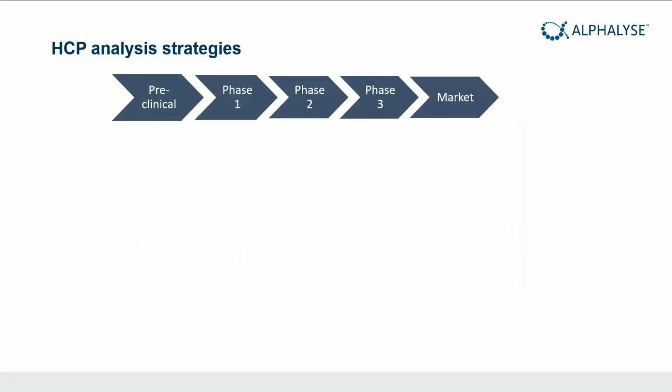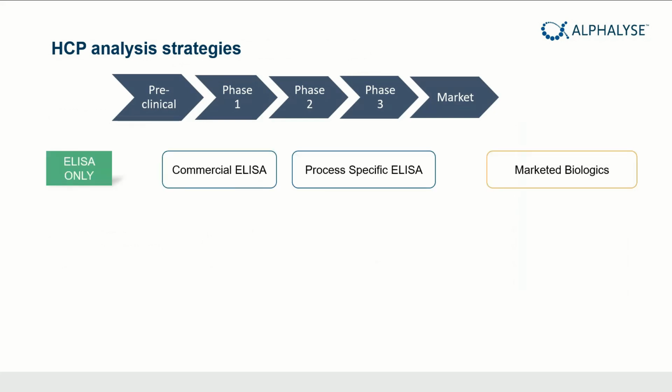So when we look at a product going through the clinical phases, there are different HCP analysis strategies. So I've just written some of the major ones here. So if you look back, when you had ELISA only, this was the typical workflow.